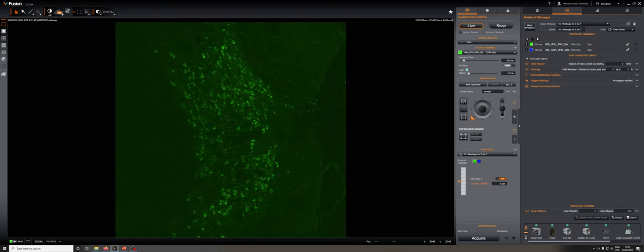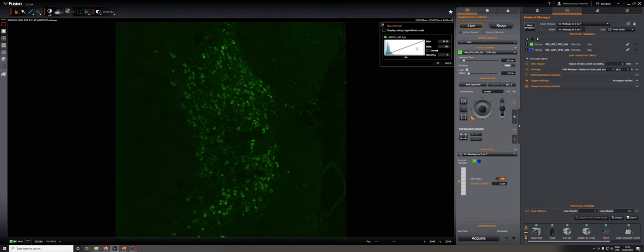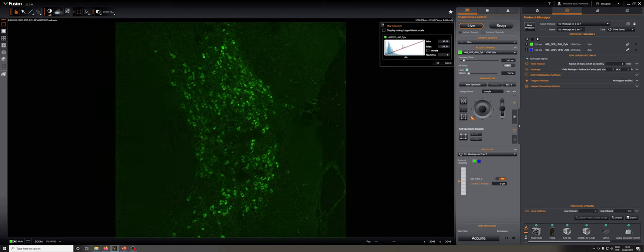The automatic adjustment will adjust contrast dynamically, so if you move to a region which is dimmer, it will brighten up. Another option is clicking here to actually decide what the min and max display options are and whether you want gamma. You can adjust these numbers by either typing or left clicking to change the minimum, or right clicking to change the maximum.